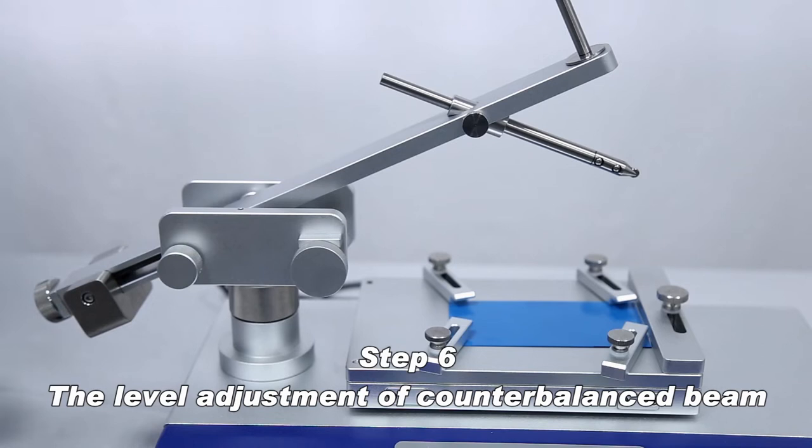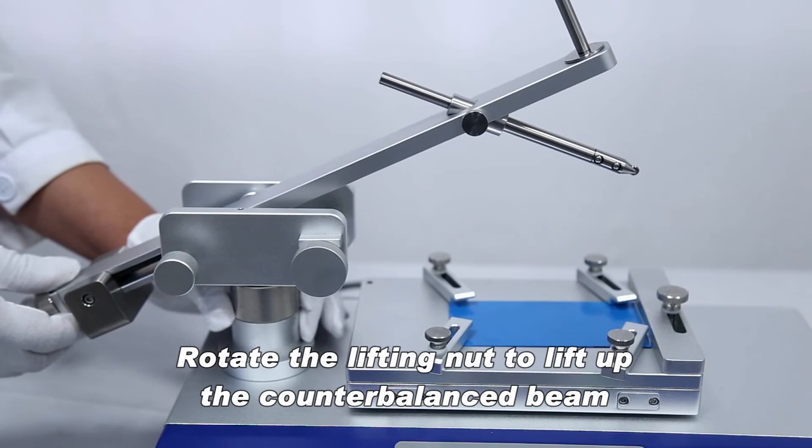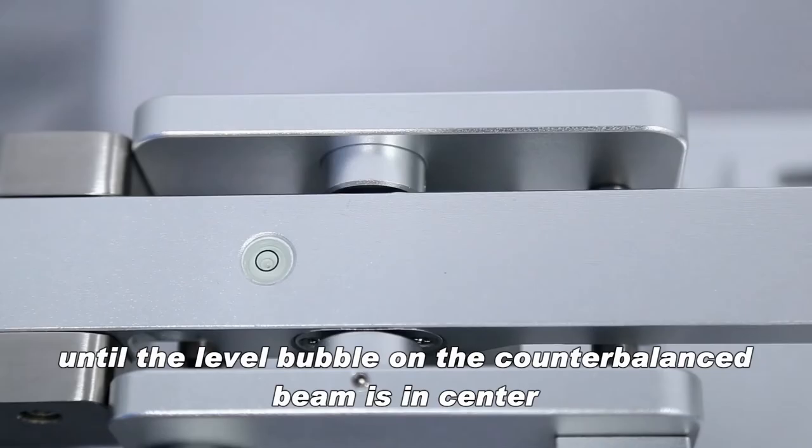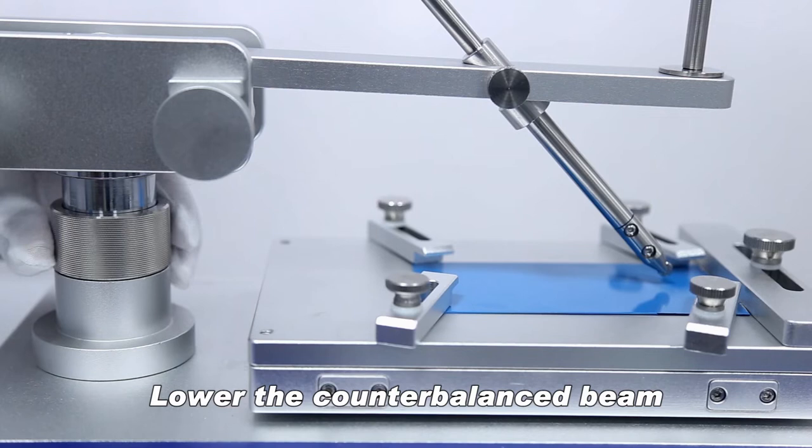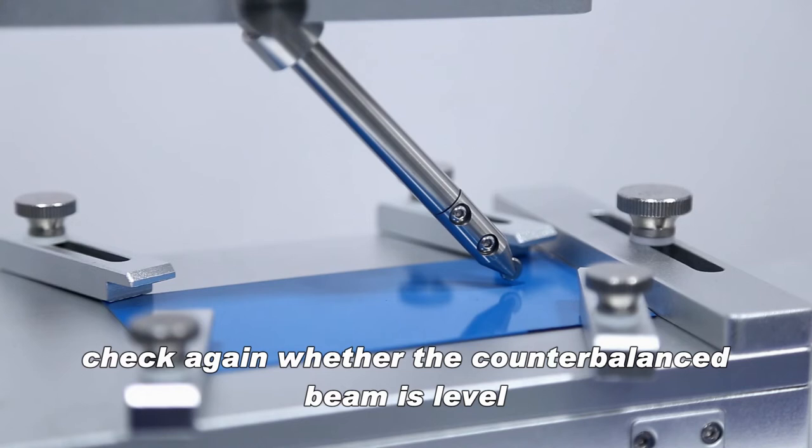The level adjustment of counterbalance beam: Loosen the limited knob and lower the counterbalance beam. Rotate the lifting nut to lift up the counterbalance beam until the level bubble on the counterbalance beam is in center. Lower the counterbalance beam until the tip of the stylus is just touching the surface of the test panel. Check again whether the counterbalance beam is level.